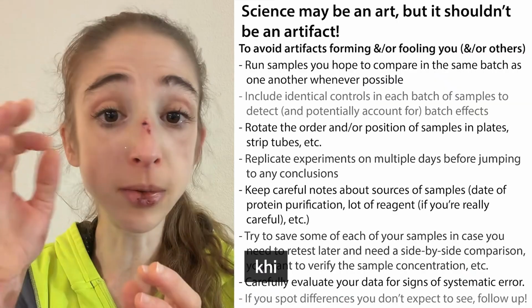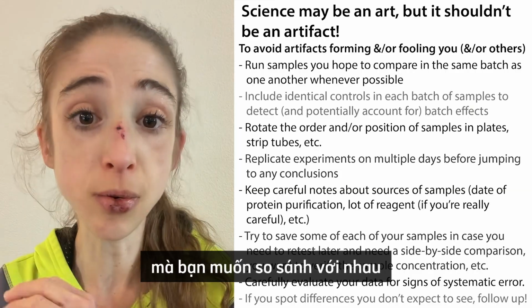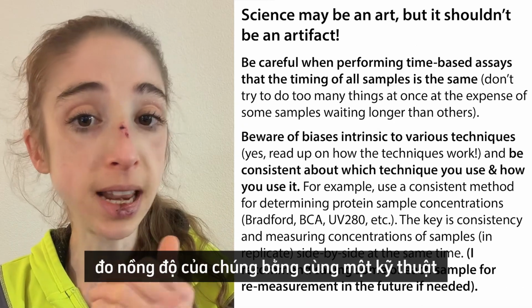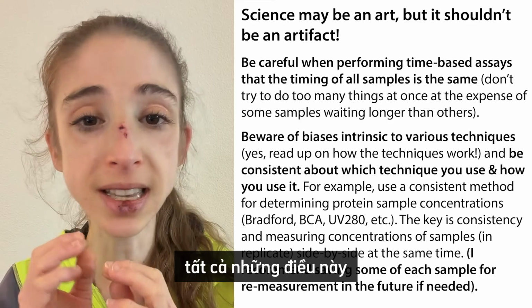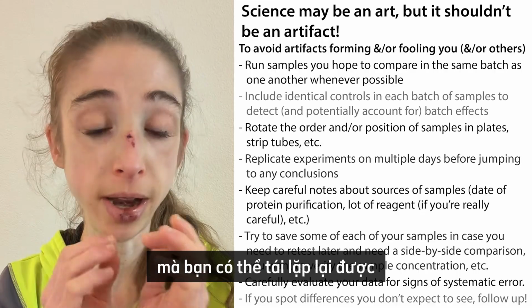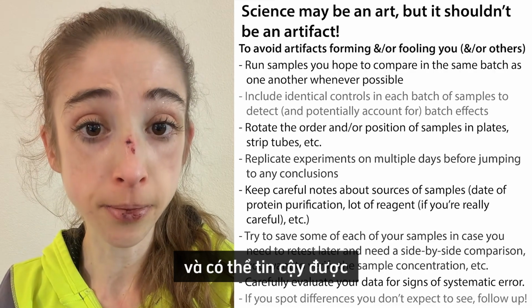Whatever you do, the best thing is always to process samples that you want to compare to one another in the same batch, in the same test, measure their concentrations with the same technique on the same day, side by side, all these things. The more side by side you can be, the better your chances of having a real, true comparison that you can actually replicate and rely on.